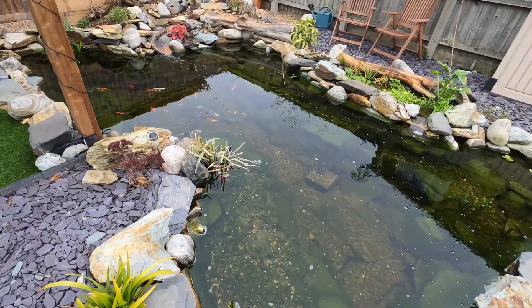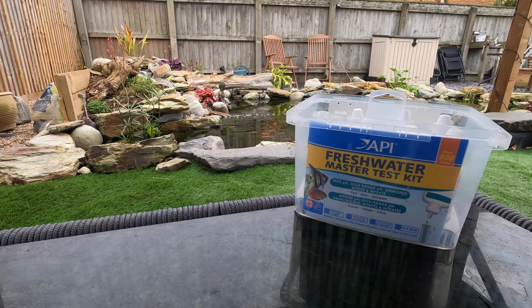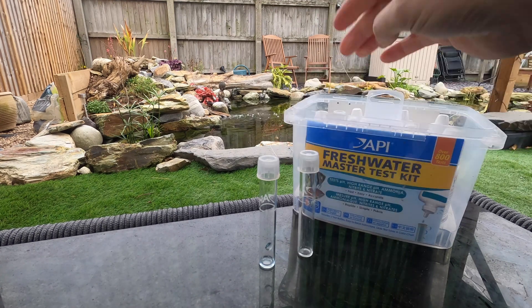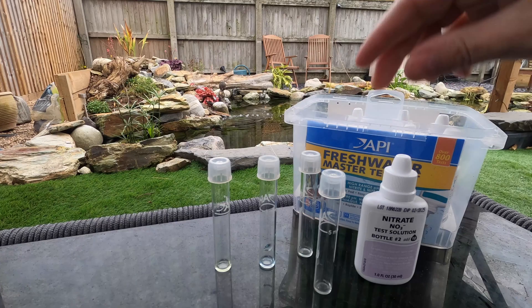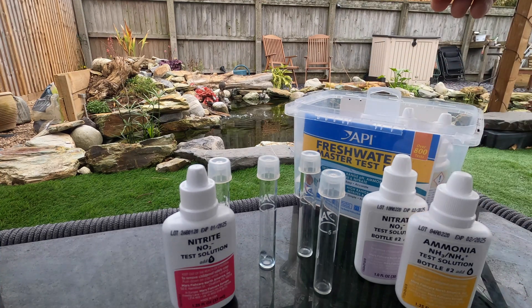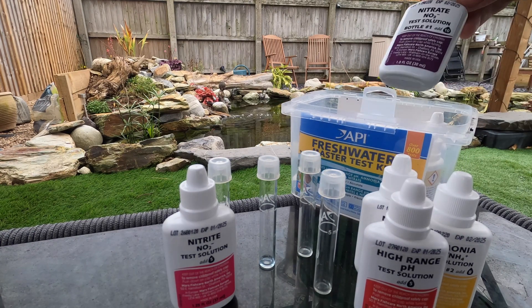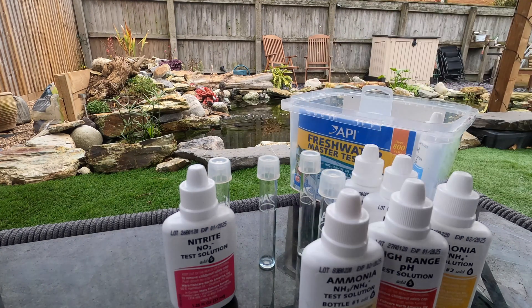We'll get the test kit out and go through the water parameters using the API freshwater master test kit. I'll go through it a piece at a time. We've got four freshly cleaned test tubes and then the bottles - a nitrate solution, a nitrite solution, ammonia solution, and we're going to go high range pH. That's the second nitrate and that one should be the second ammonia.